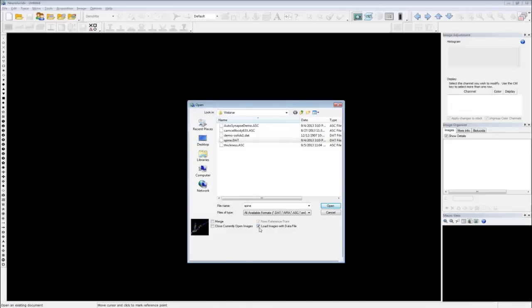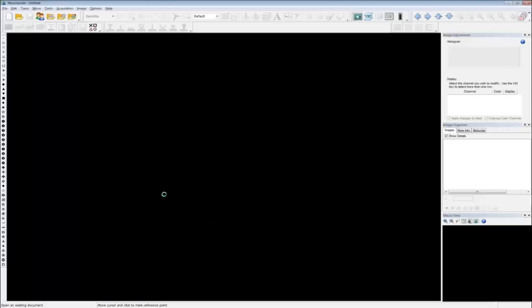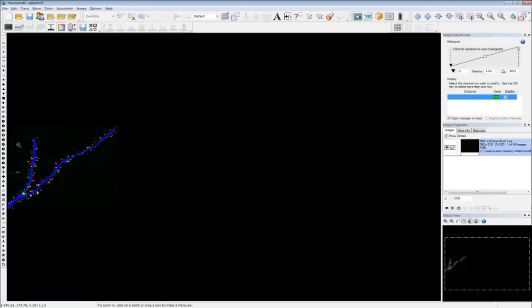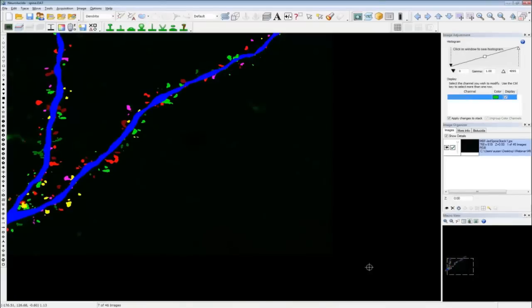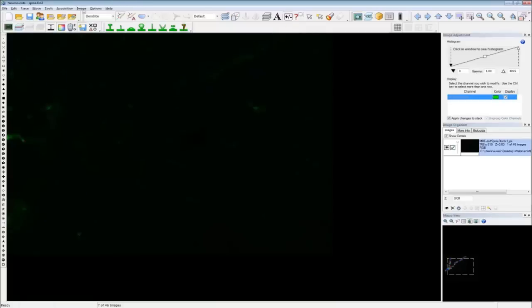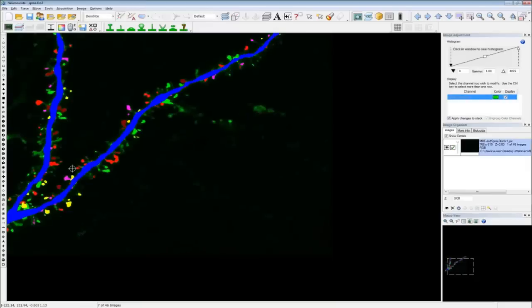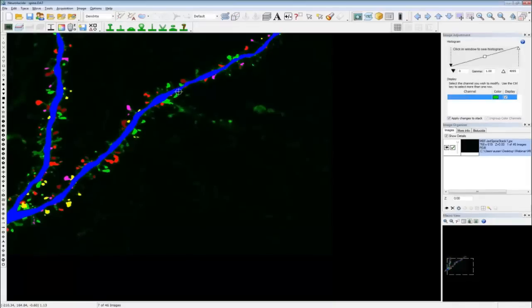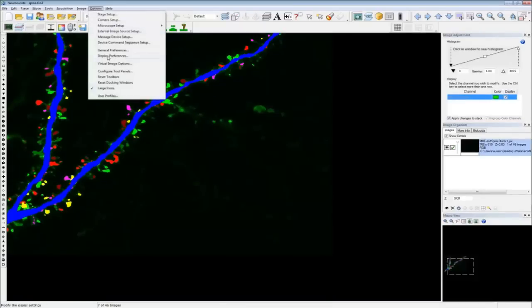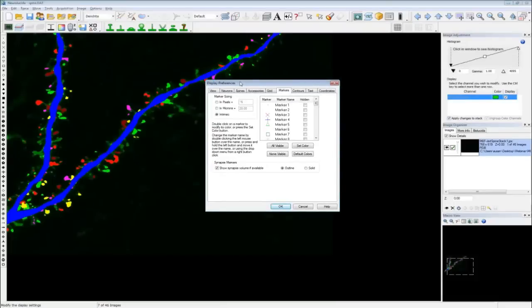One common user error: if you load a DAT file and don't see image data, check that you have the option to load images with the DAT file enabled before troubleshooting further. Now we're going to talk about creating screenshots. This is useful in Stereo Investigator to demonstrate what to count, what the probe does, and what it looks like when you're actually in process — a very handy way to demonstrate the intricacies of stereology in a simple and easy-to-view way.